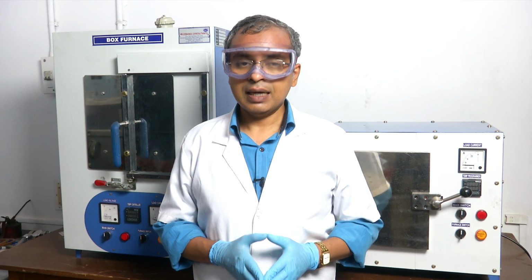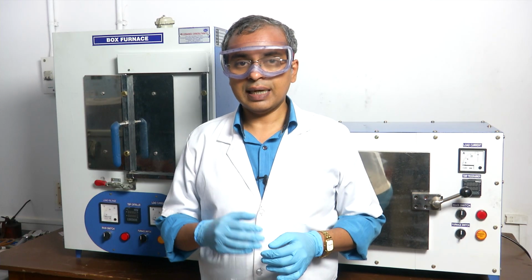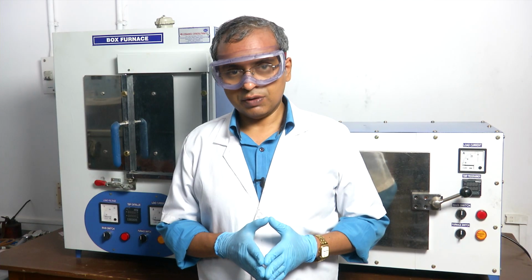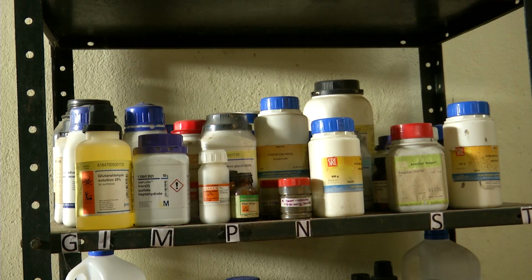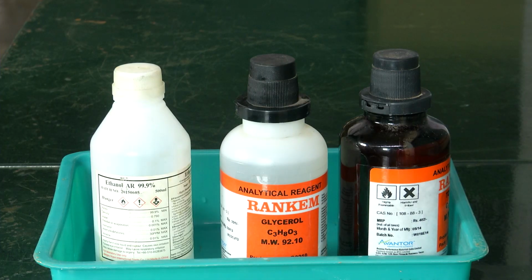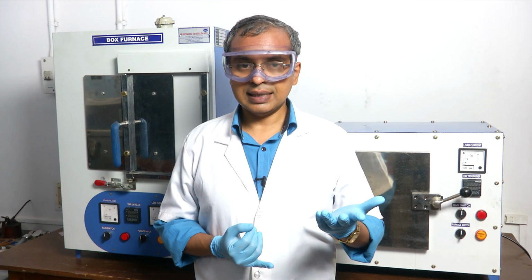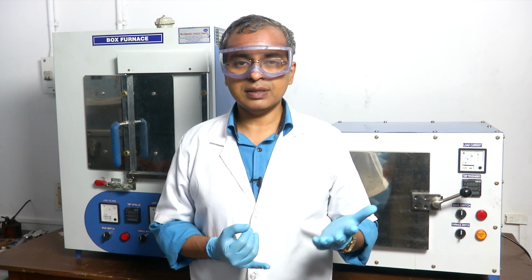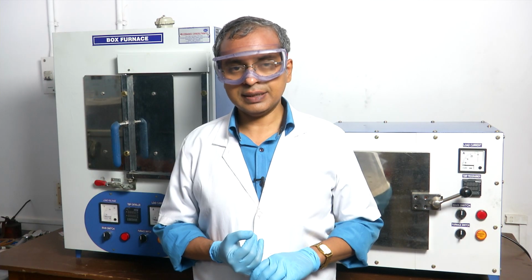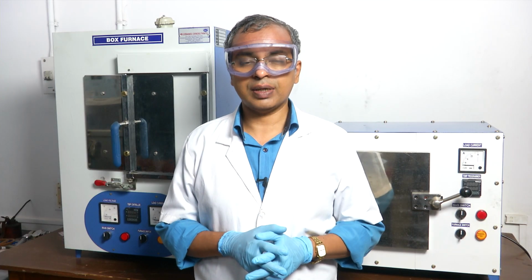Now, some of the things that you would see in a typical lab which require formal ways of addressing so that you do it in a safe manner are, first of all, chemicals. In most labs you would see chemicals. So, chemicals is something that is very common in most labs. You will have acids, you are going to have bases, you are going to have maybe powder samples, maybe biological samples, and so on. So, a variety of different samples which are all essentially chemicals. You could have a variety of chemicals which are present in a lab, and so that is something which requires some level of formal attention for you to handle safely.